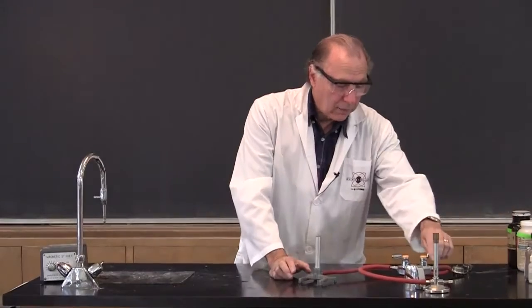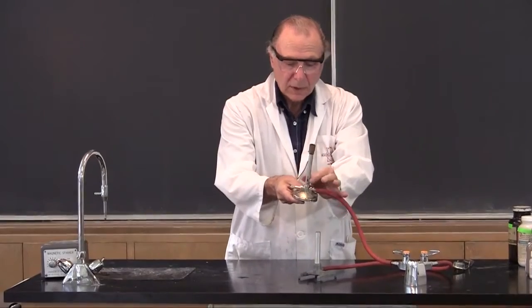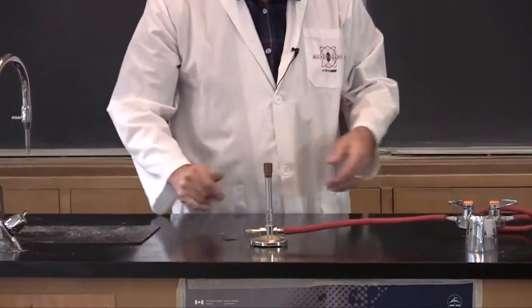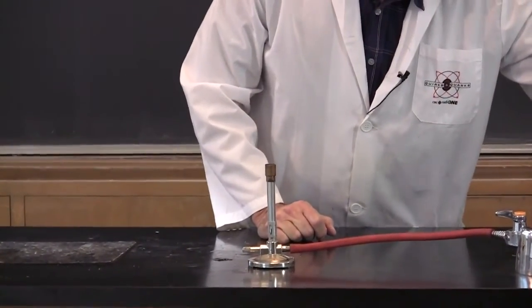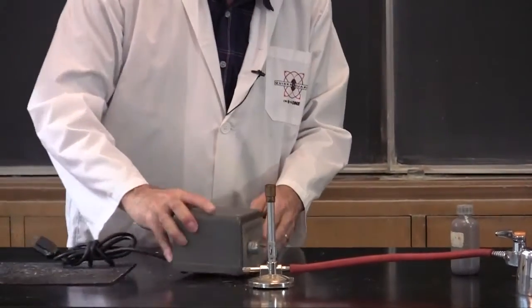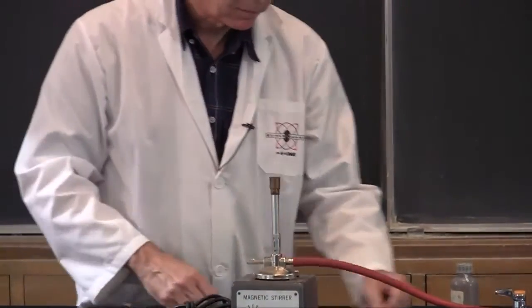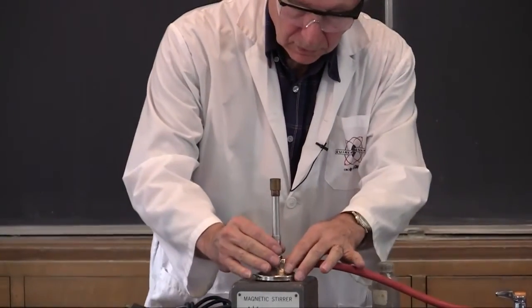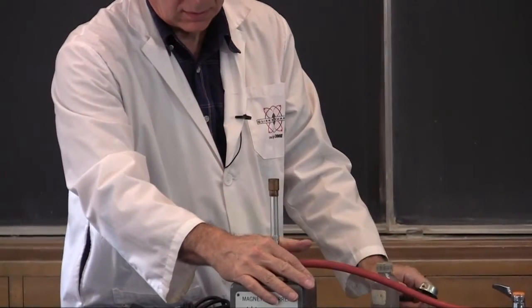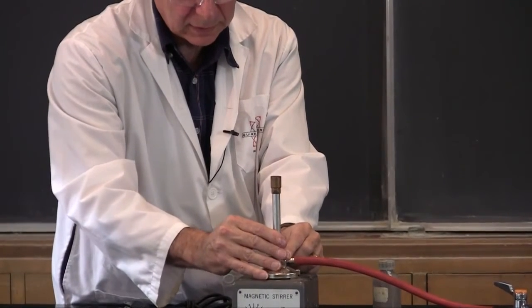All right, now if you have this type of burner that has a collar, this is where the air comes in, we can also use that. And you have to have squeeze bottles here, and for this purpose I've put a little magnetic stir here just to raise it up so you can see it. So we'll light this. Don't want to get too much air going there.